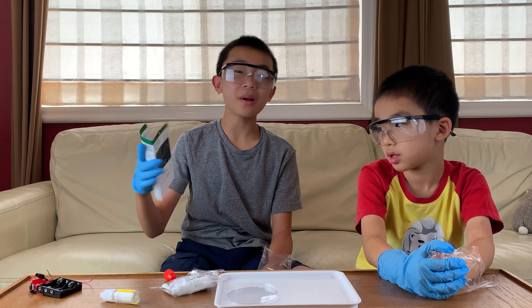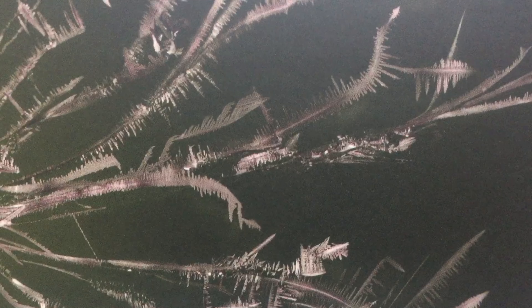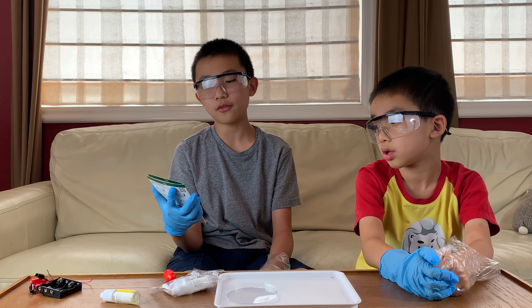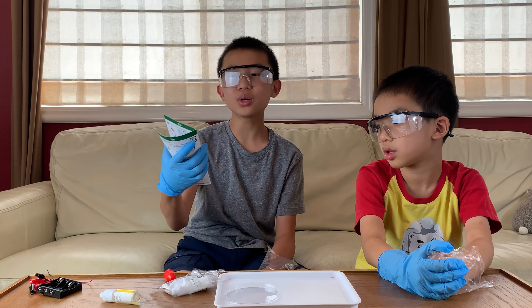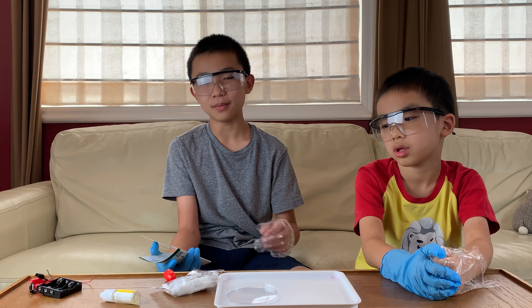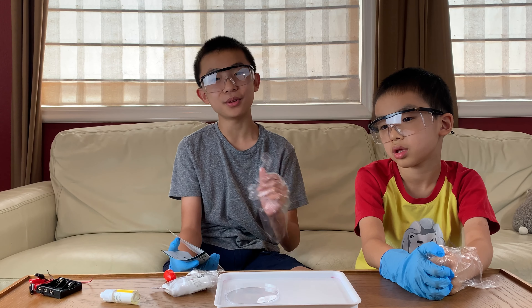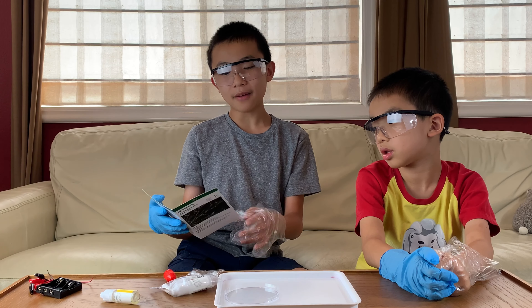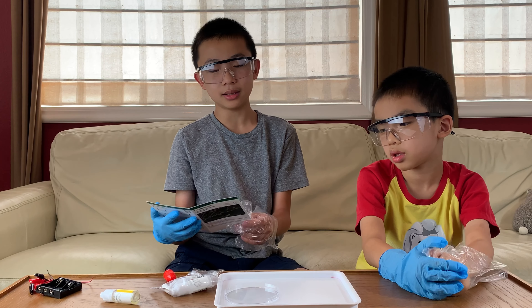We're back and ready to start the first experiment — this is called tin dendrite. A metal tree grows before your very eyes! The difficulty is 1 out of 3, but the danger is 2 out of 3. We are working with chemicals we do not want to get on our face or skin. Step one: we have to prepare the tin chloride solution.